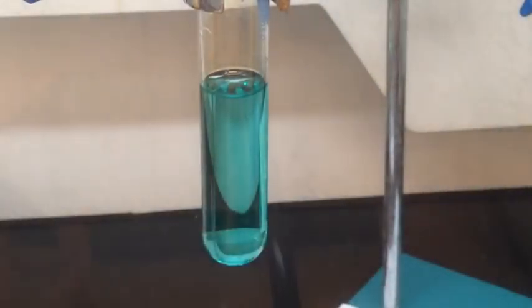Mixing that well. Okay, eventually we get the whole solution well mixed, and at the end you notice the whole test tube becomes blue, all the solution becomes blue. So this is how it works. Can you write the chemical equation for the reaction between copper and concentrated nitric acid? I bet you can. So thank you.